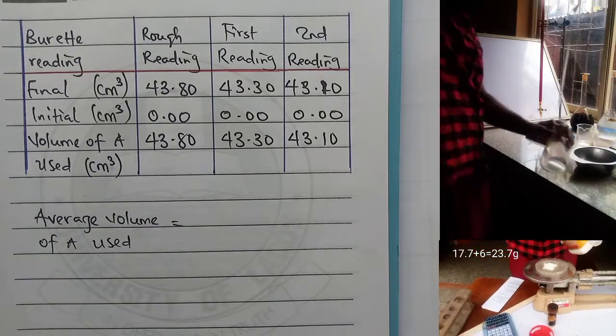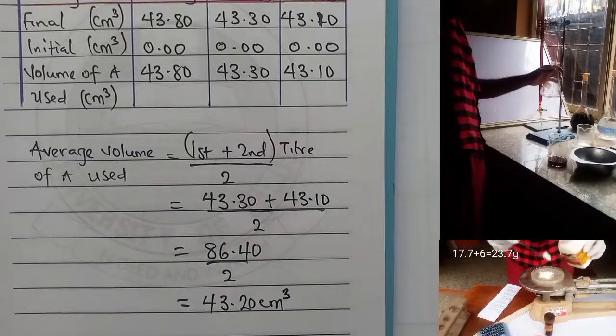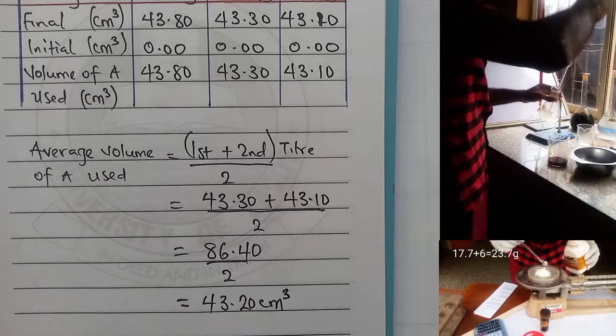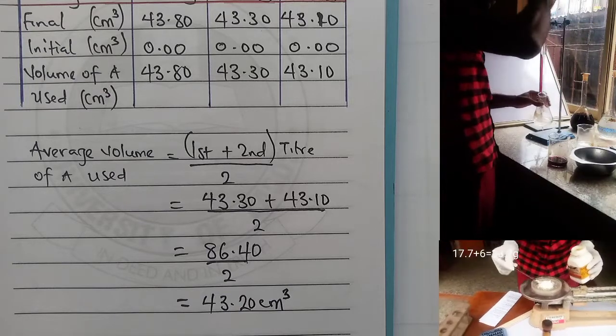Okay, we have, so 43.20 is the end point. Okay, we can go for the questions.